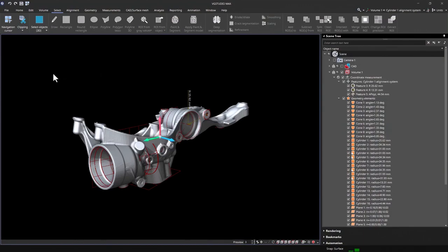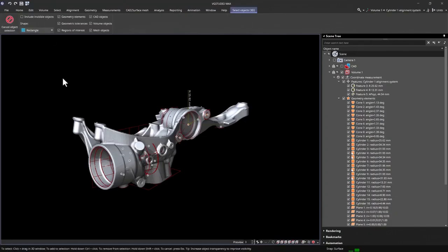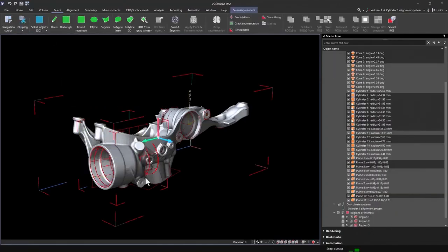view. Start the selection tool of your choice and draw directly on the view. Objects are represented by small bubbles, and as soon as a bubble is inside of the drawn shape, the object gets selected.